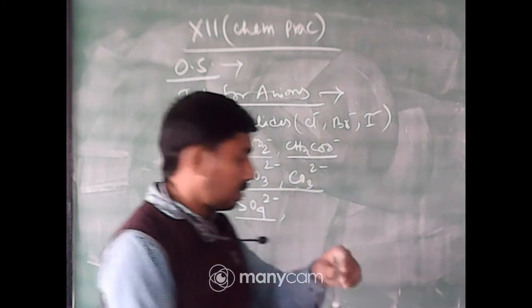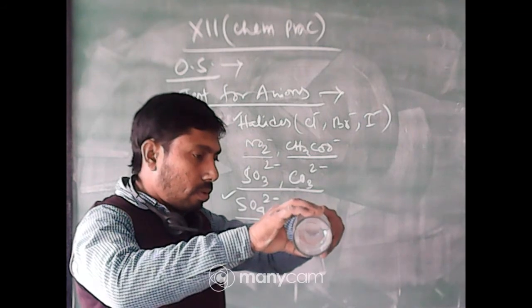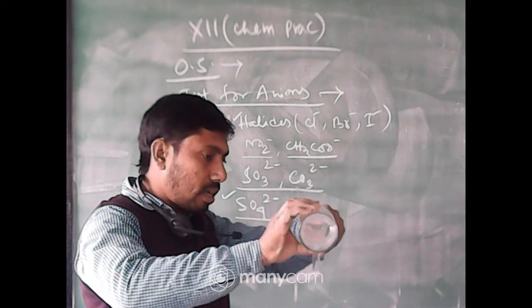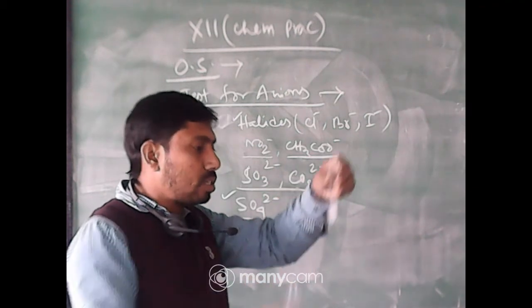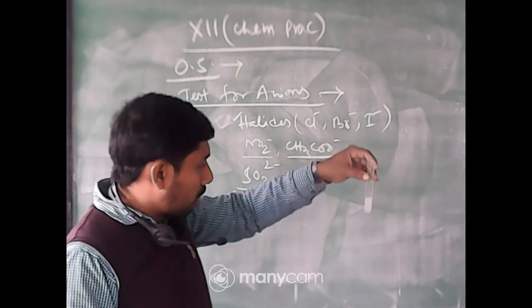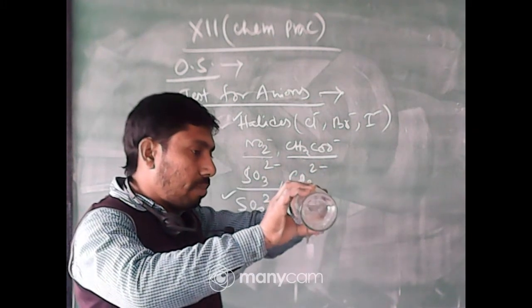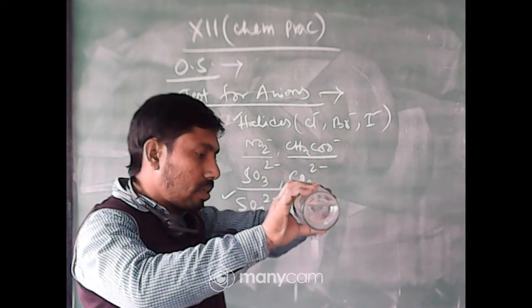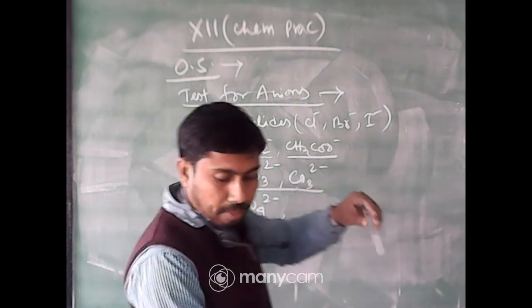I am adding it here. Check that the density of the precipitates is decreasing. That is, our objective is whether the PPT is dissolved or not. You can see that only the volume is increasing, but the PPT remains unaltered. No change in the PPT.